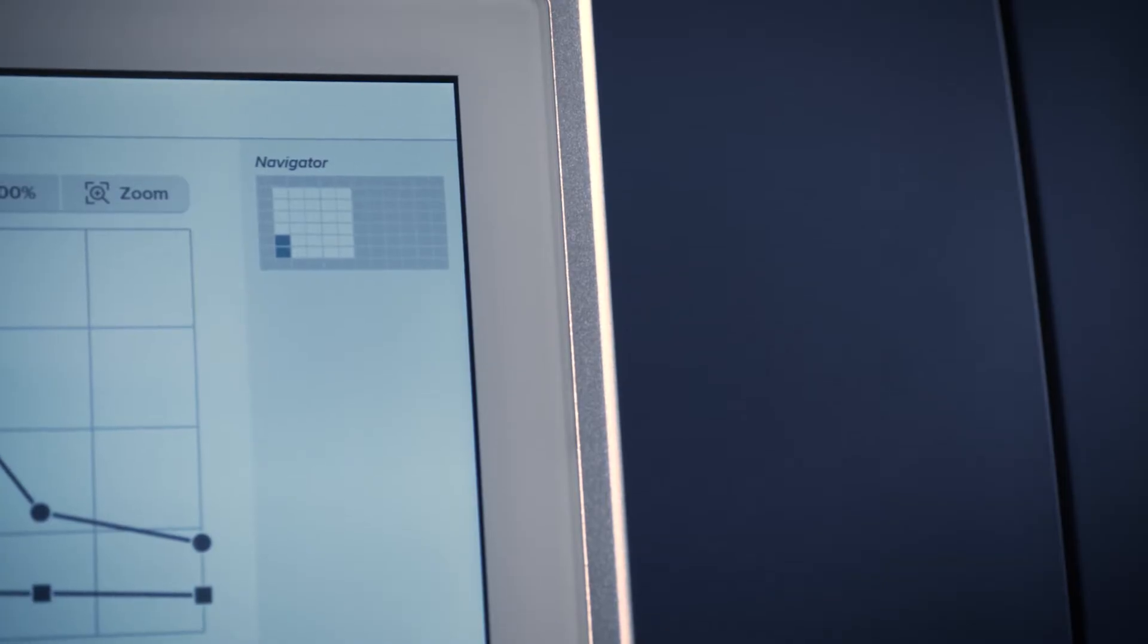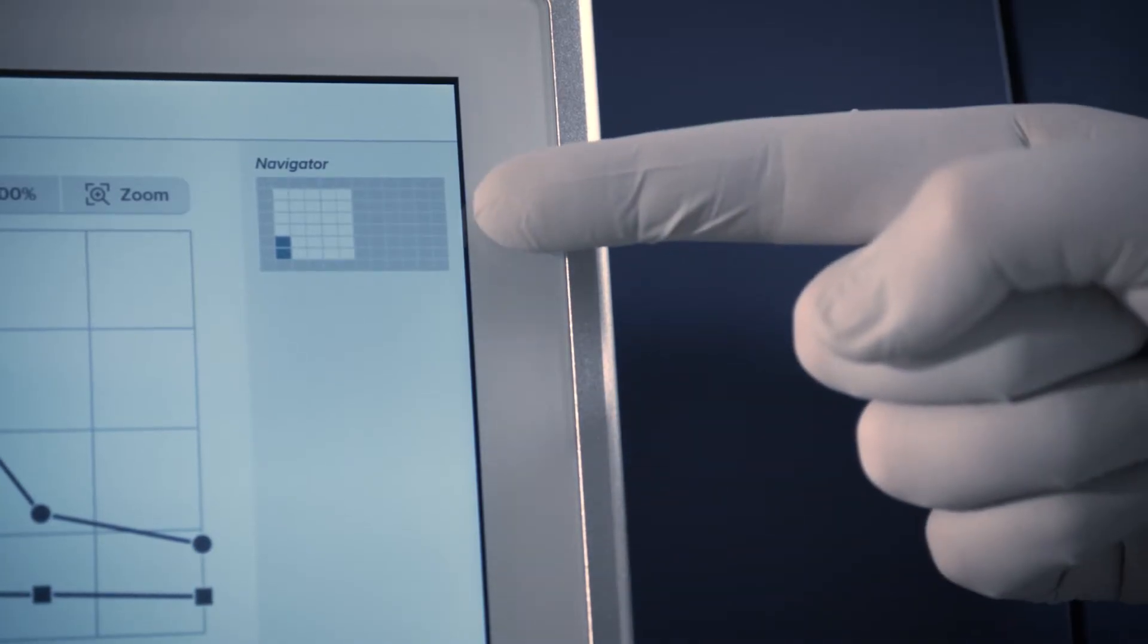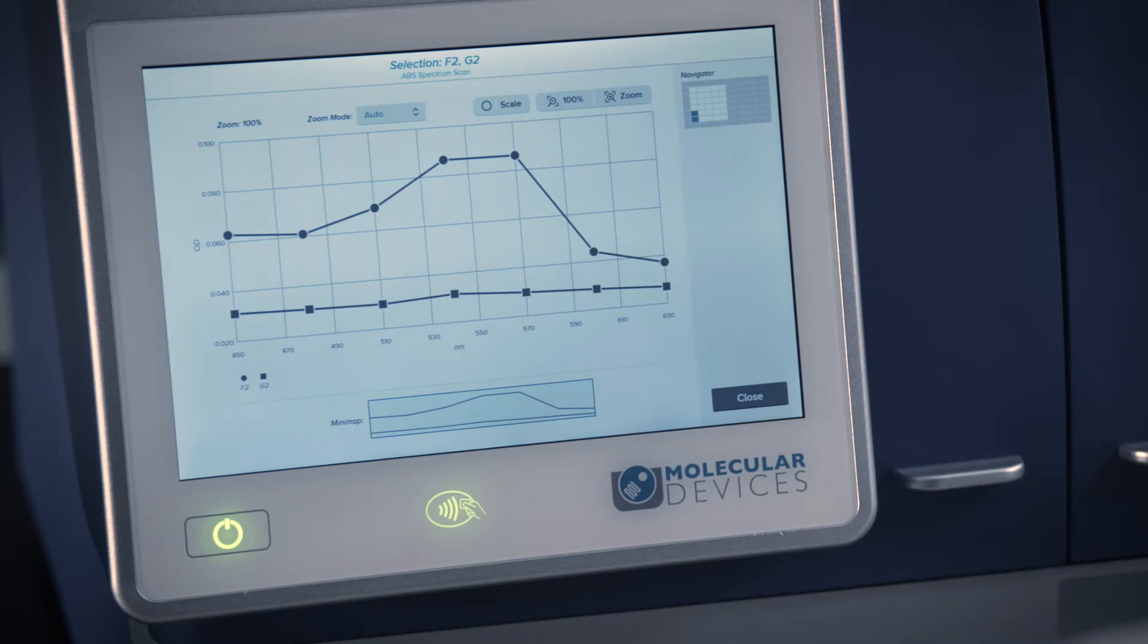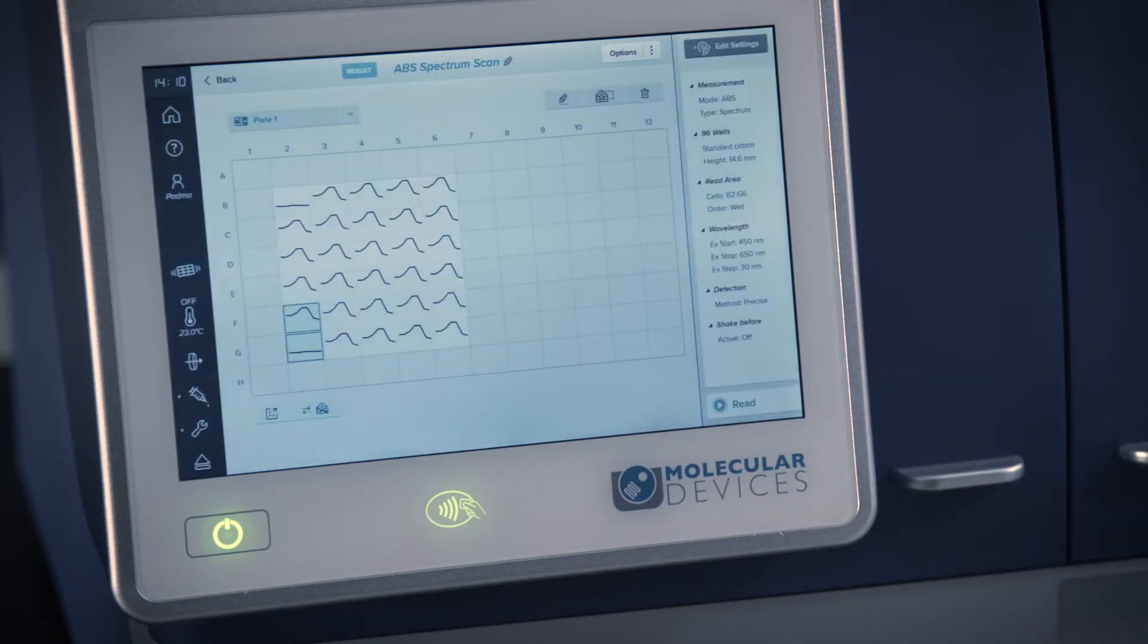The selected well locations will be displayed on the navigator plate map. Touch Close to exit the graph view.